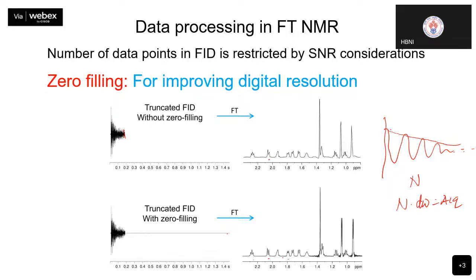So this is improved here with regard to the resolution in the spectrum, but the distortion in the baseline is not gone. See here, this is a distortion in the baseline, and that is the result of the truncated FID. Because there is a sudden step function. It suddenly drops down to zero, and you are putting zeros there. And the consequence of this is all these sinc modulations here in your NMR spectrum.